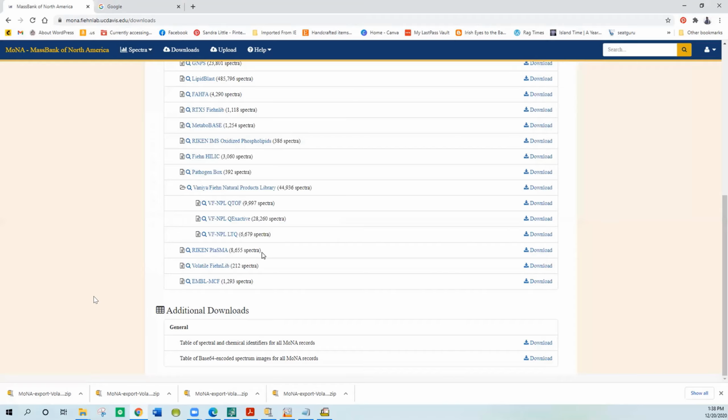If it's not in the right folder and you create it somewhere else, sometimes the NIST program will try to put an alias within the NIST 20 MS search folder. And that might confuse you. It's better if you get rid of that file with the alias in it and actually put the folder that has, I think, 45 to 55 files, the indices that it created, in the NIST 20/MS search folder, so it can be used by the NIST search program. So that's pretty much it. That's how you do a conversion.